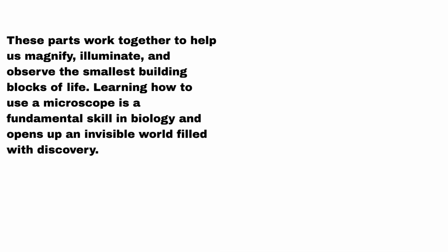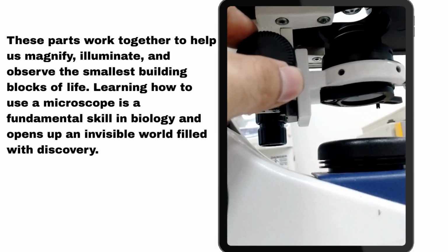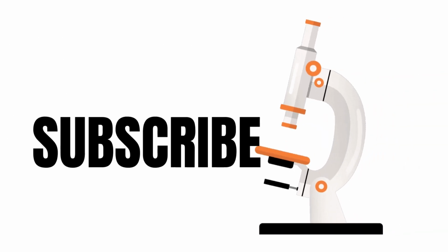Learning how to use a microscope is a fundamental skill in biology and opens up an invisible world filled with discovery. So next time you look into a microscope, remember, you're peeking into the world of the unseen.